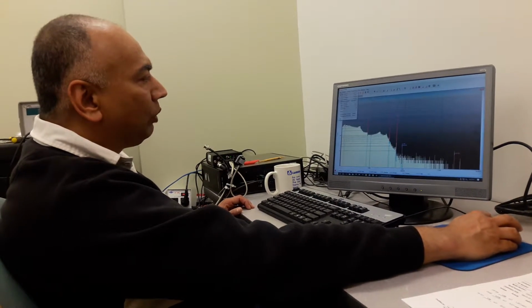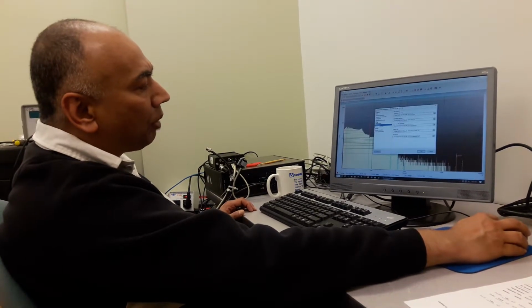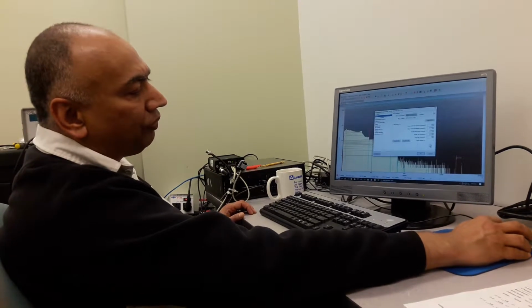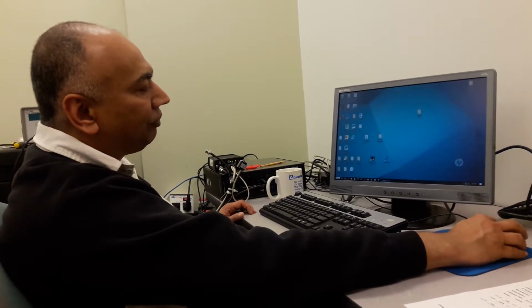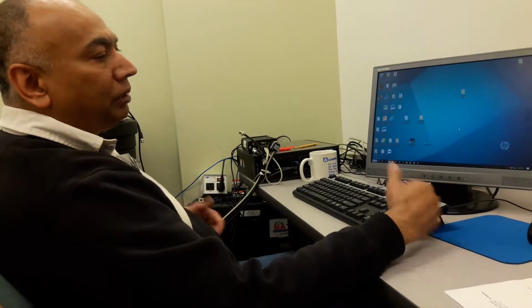Thank you very much. Now I'm going to go in there and show you the sequences how to close this. I'll go to properties, I'll go to MCA. I will make sure that my high voltage is off. I don't want to close this with the high voltage on, and then I can simply go in there and exit.